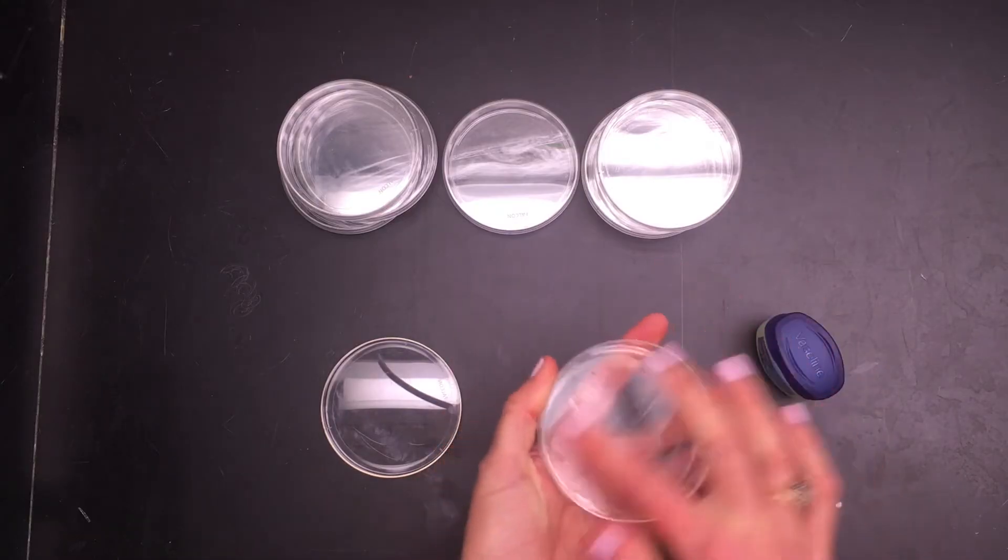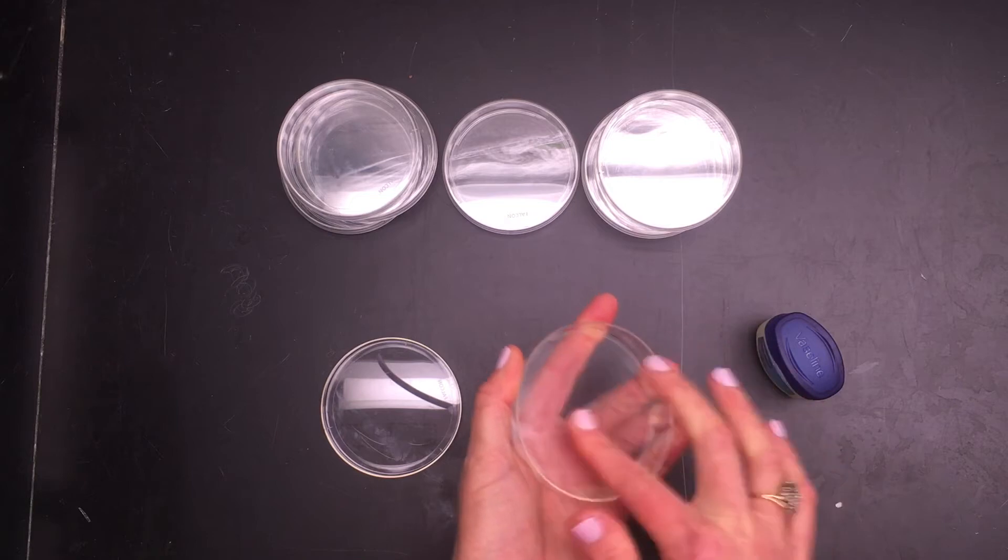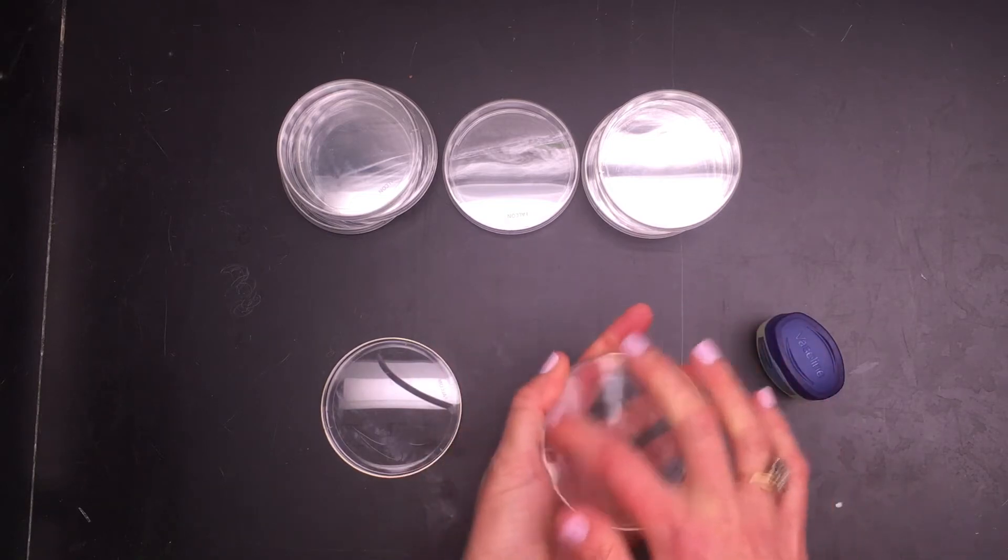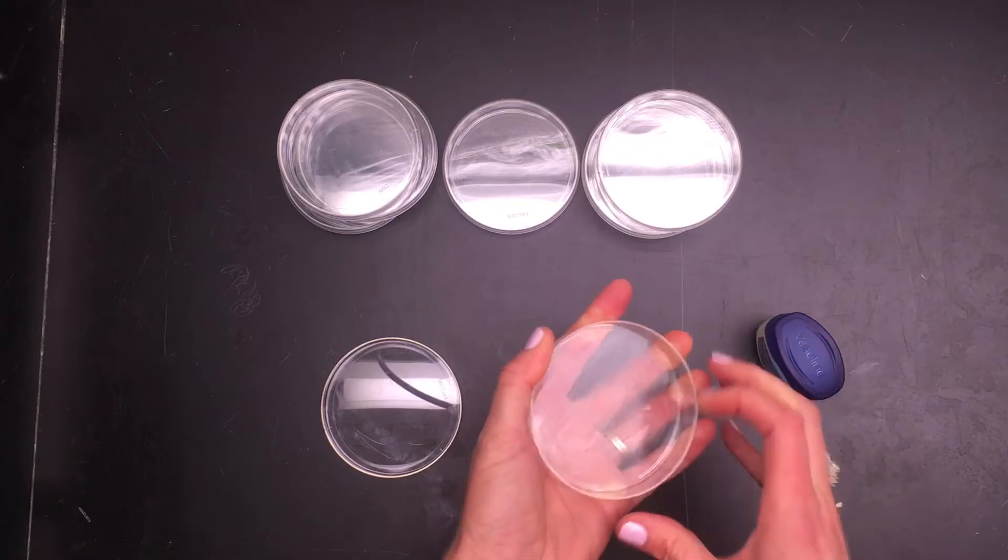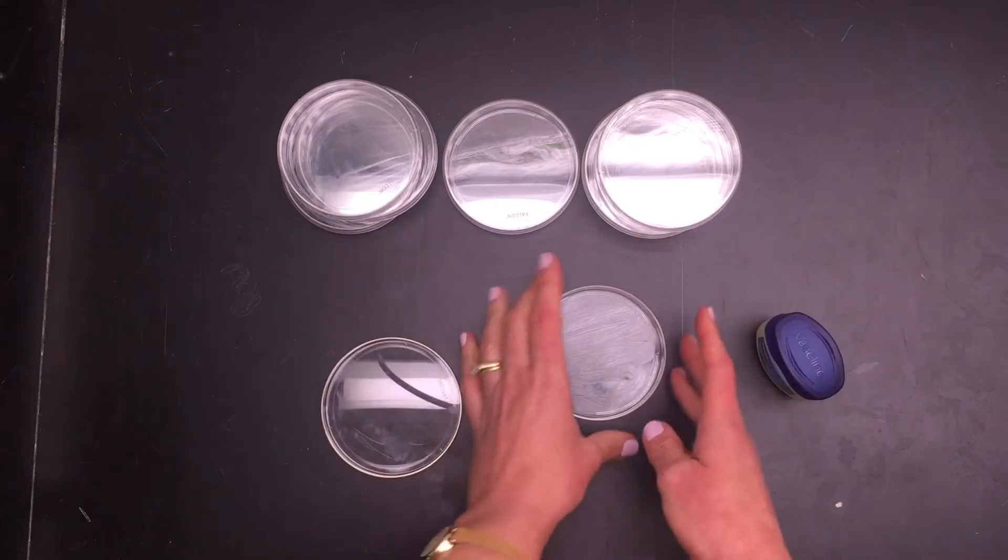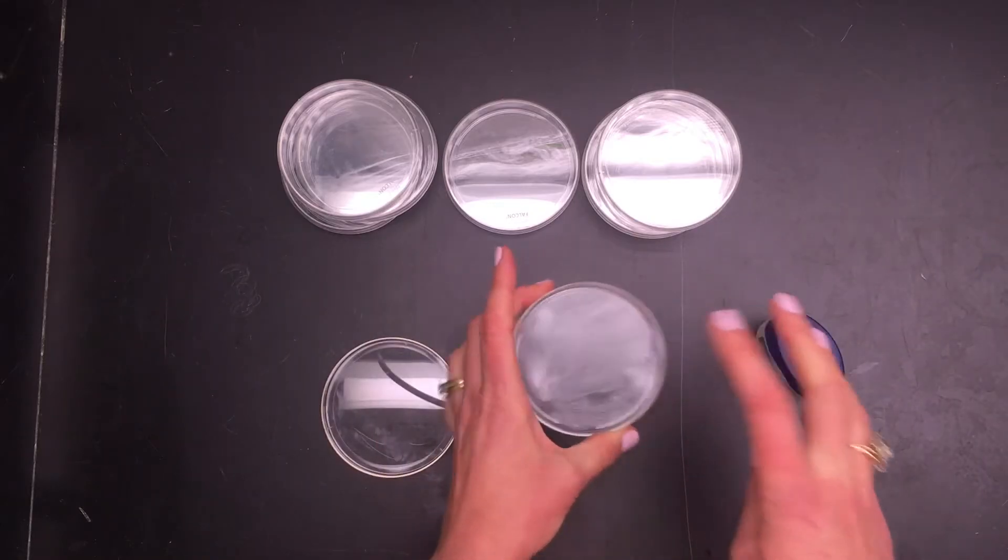It needs to be a thin coat. You don't want it thick and globby—it will be harder to count your particulates that way. A thin coat is plenty so that when particulates fall from the air onto your dish they will stick and you'll get some good data.